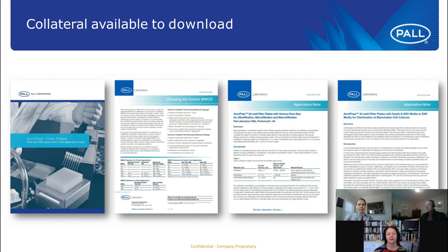Is the 24 well filter plate different from a deep well plate? So when we talk about the deep well plate, those particular plates typically have a solid bottom. Whereas the AcroPrep filter plates and the filter plates that I was talking about today can be used with a solid bottom plate. For example, 24 filter plates do come with a solid receiver plate, whereas 96 and 384 do not. But just because these plates are a really standard microplate design, you would be able to use them with standard solid bottom plates as receiver plates.